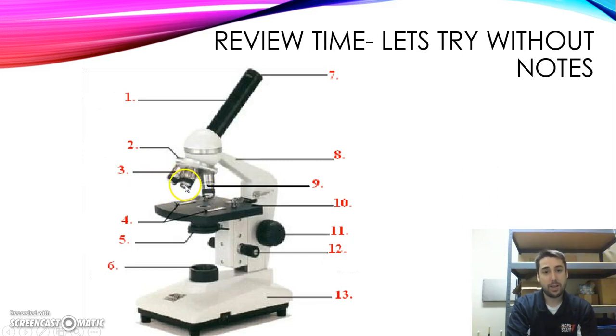I would add a line here. I don't know why I didn't do that, but there should be another line in here to label what is that middle level objective, right? And also put the total magnification, even including the eyepiece on there, and that will help you practice and master these skills so that you can go into any lab and view any specimen and see all that sweet stuff that's in pond water and all that gross things that's crawling all over this world.